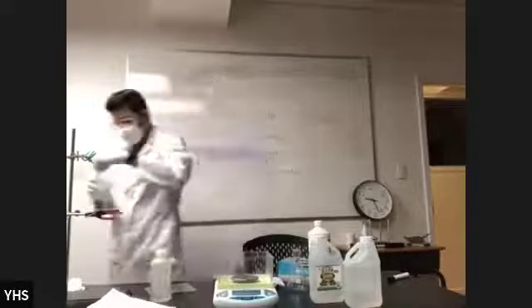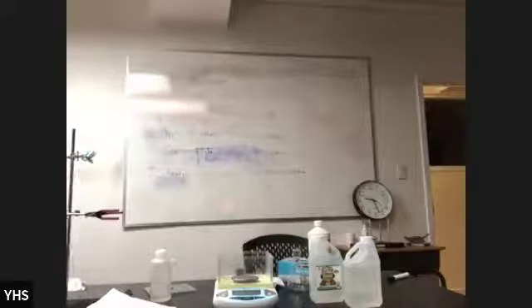All right. I am stirring this as the procedure says. As I stir, there's more reaction happening.